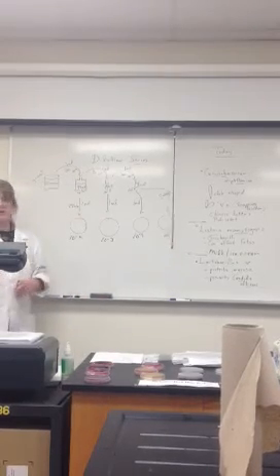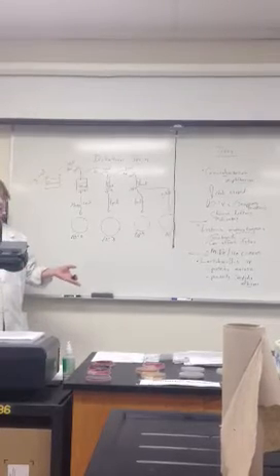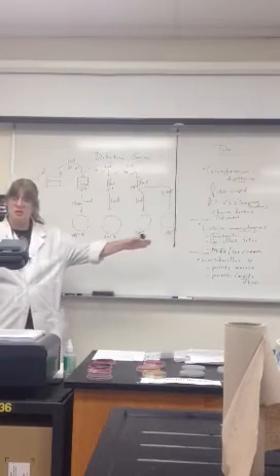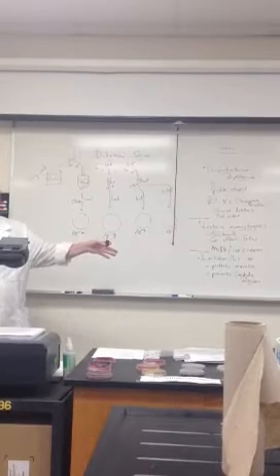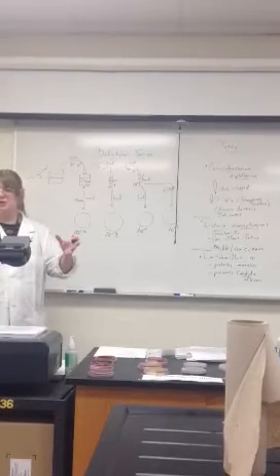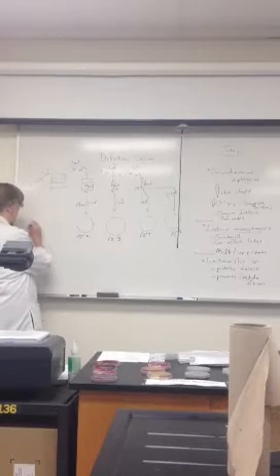Now, the next step is you have to be able to look at 4, 5, 6 plates, decide which ones to count. You don't count all plates from every dilution. You only count the plate that appears to be what in what window? 25 to 250 or 30 to 300. Probably not showing at 30 to 300, but you're going to see both or something around there everywhere you go. So I'm going to say either one's acceptable to me.